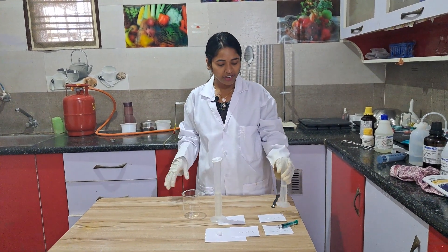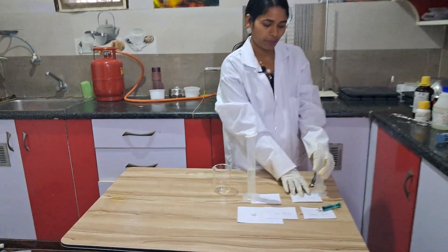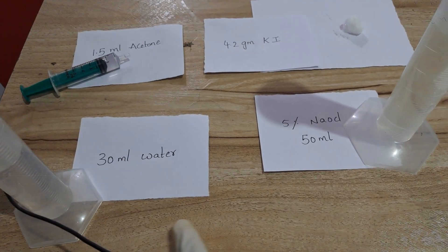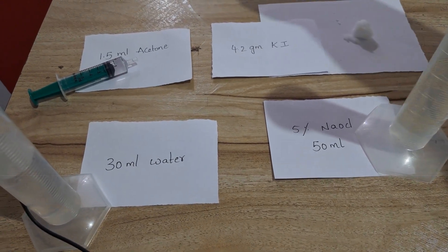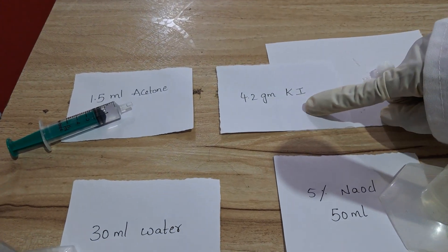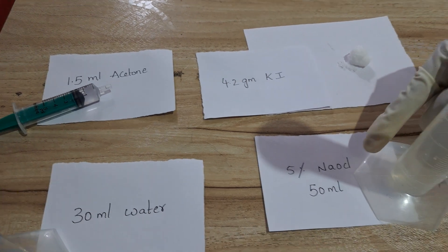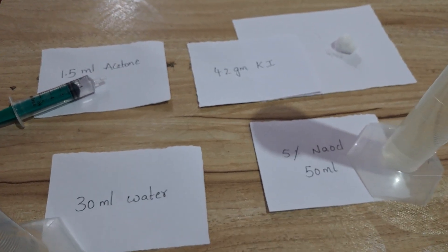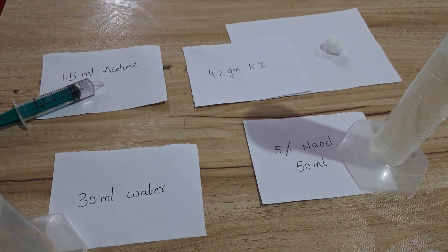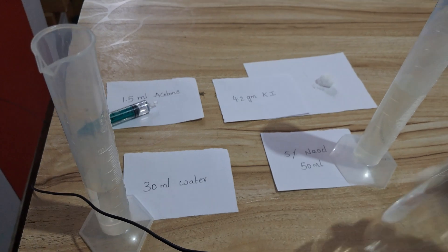Required reagents: we need 30 ml of water, 1.5 ml of acetone, and 4.2 grams of potassium iodide, and 5% sodium hypochlorite — we need 50 ml of that. These are the 4 reagents and you will also need 1 beaker.